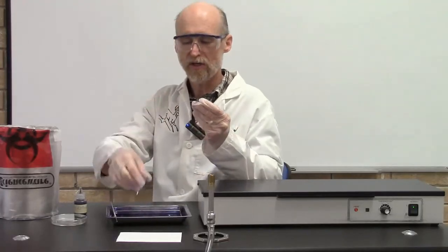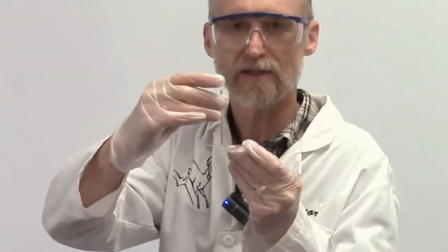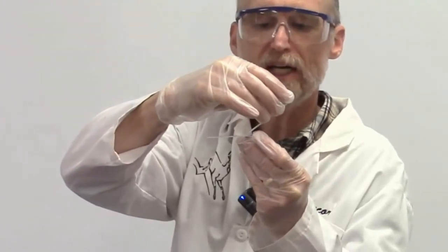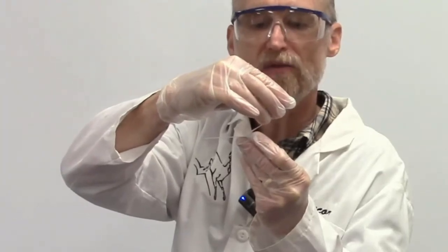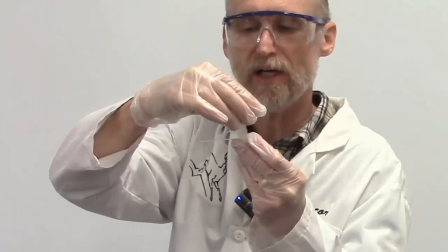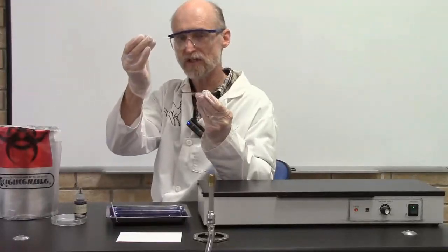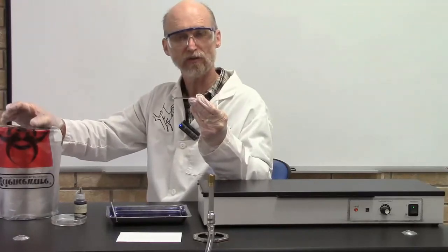In this part, you take your other slide, your spreader slide, and you put it on your base slide at about a 90-degree angle like this. Then lean it towards the dye drop, towards your fingers, and pull it up so you're pulling it into the dye drop. And the dye will grab onto the slide. Then you push it away from your fingers, and that will spread the dye out. You just keep spreading it out, and as you get towards the end of the slide, just roll the spreader slide off. Now this is contaminated with bacteria, so you want to immediately drop this into a biohazard bin or into a beaker full of bleach and water.